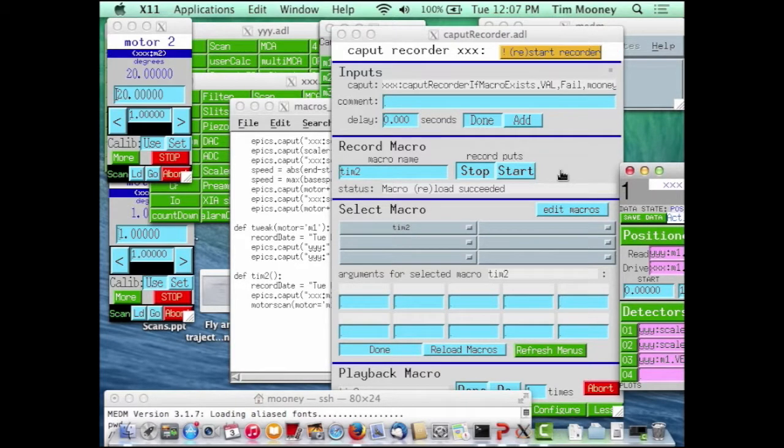There is nothing stopping you from recording for however long it takes, to record all the user input. That way, if the user is trying to figure out why the monochromator is not at the right energy, what happened overnight? This happened at 1BM, for example, several times, and it was a big mystery.